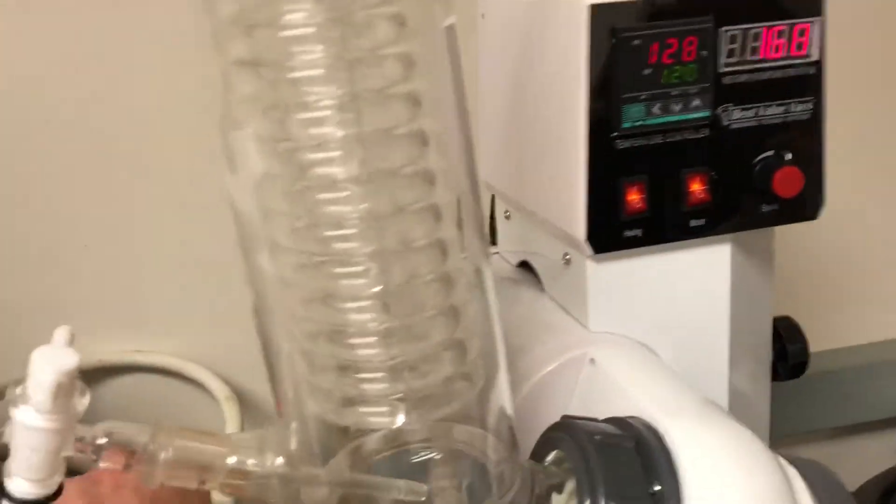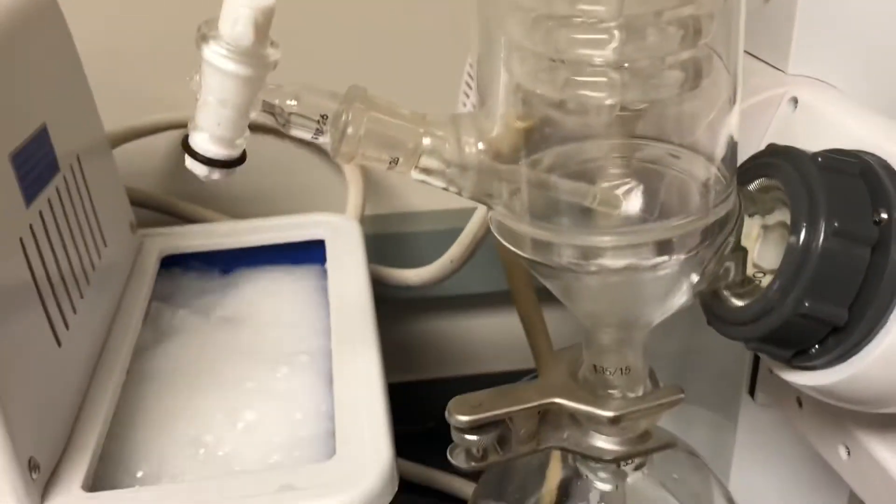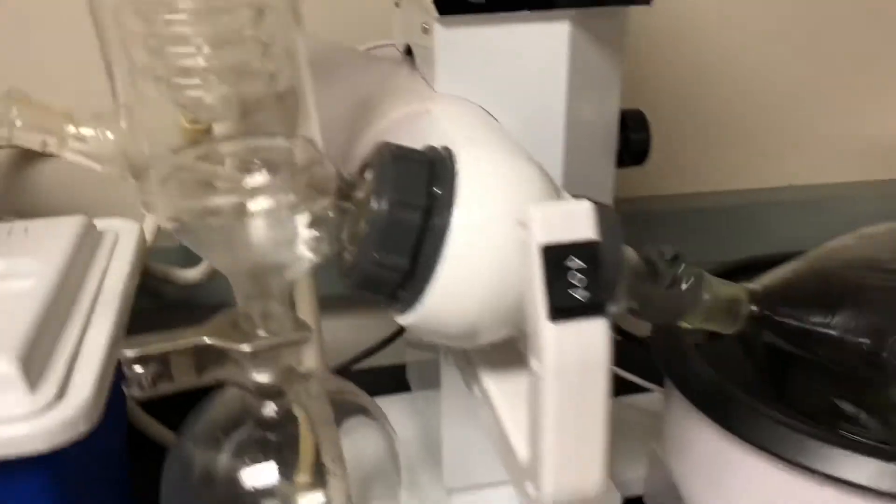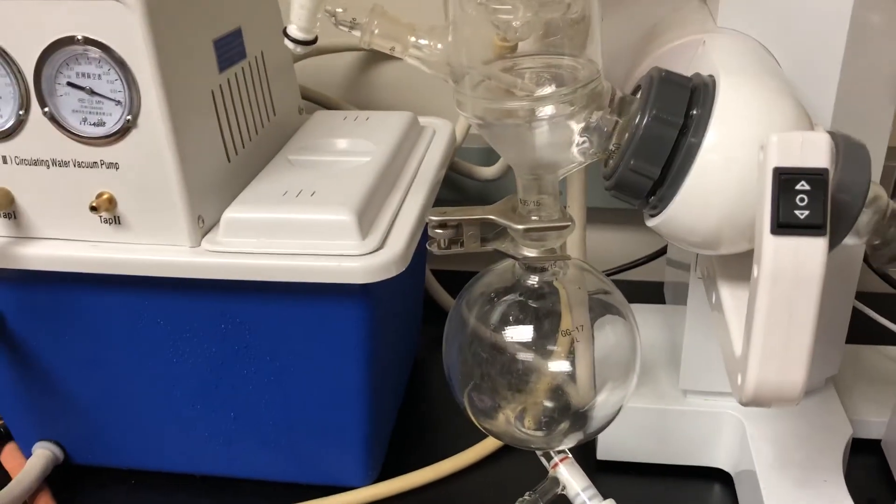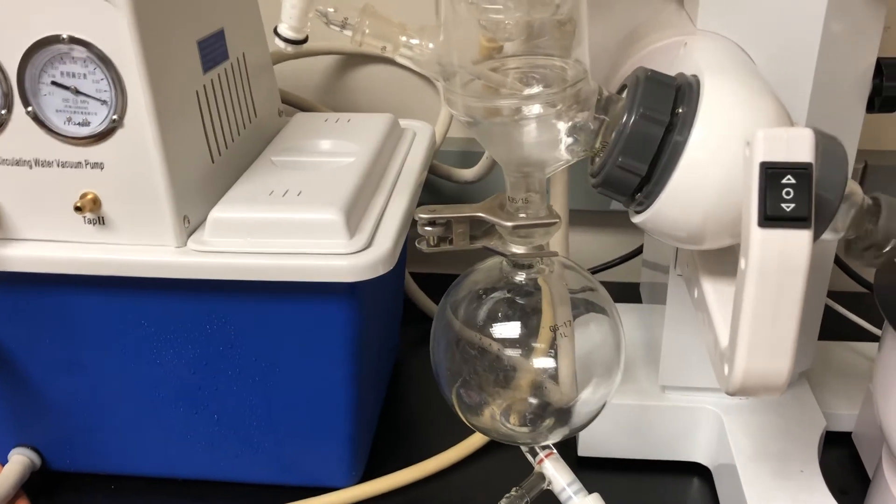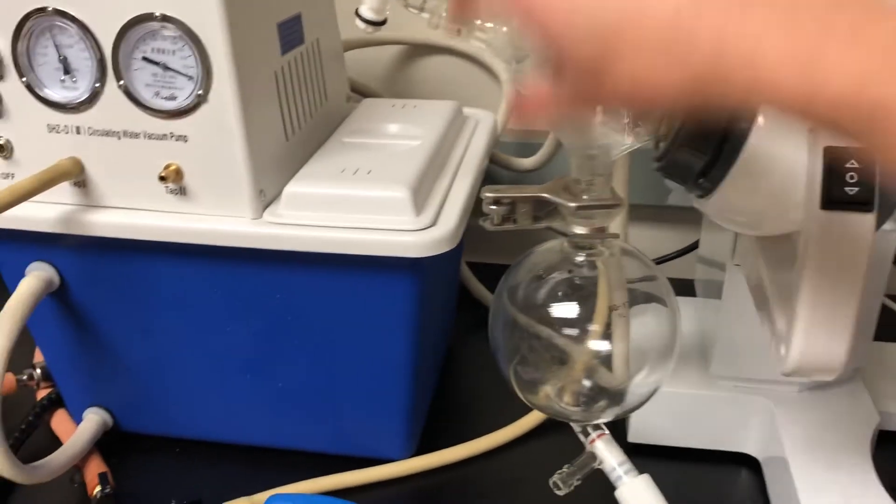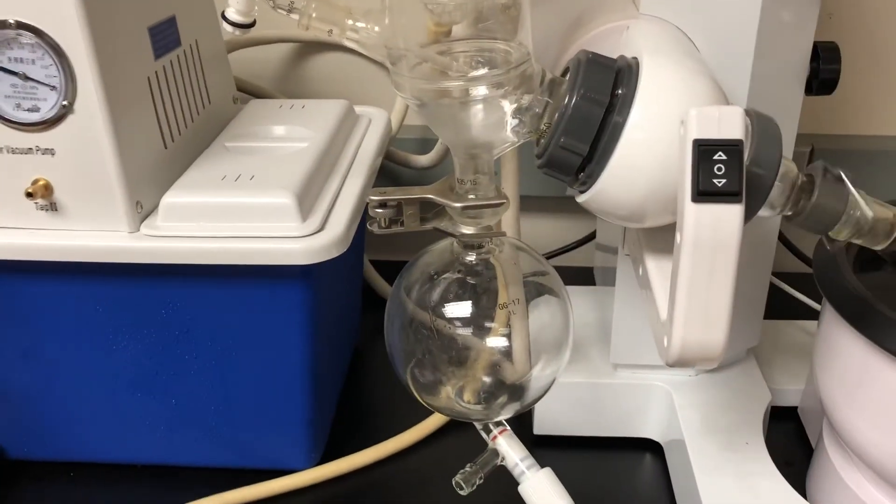You see our ice water here is starting to froth up a little bit. I have used this water a couple of times. You want to make sure you do change the water every time because it gets a little bit gummed up. Again, it doesn't have a strong micron pull so it doesn't pull a lot of that vapor all the way up into the water, but it still gets in there so you get some contamination.